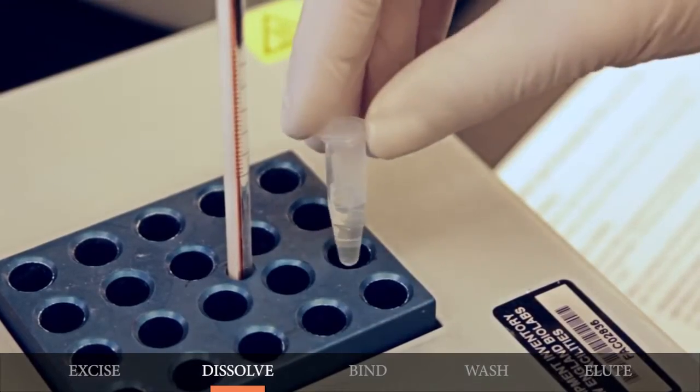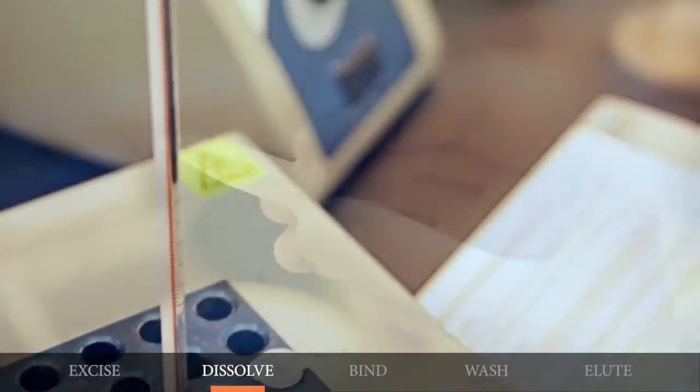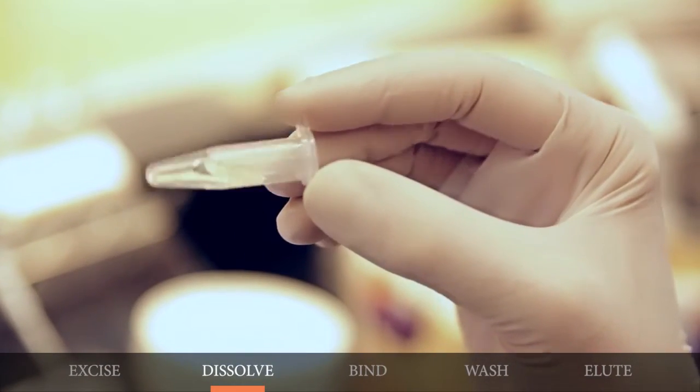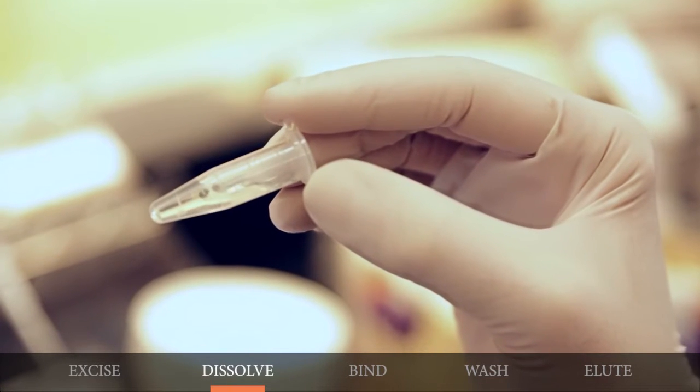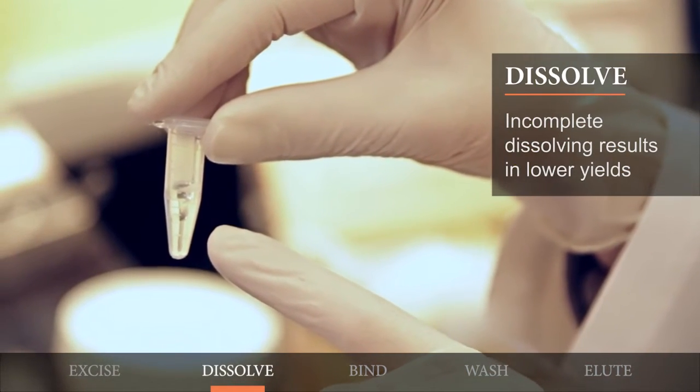Incubate the sample between 37 to 55 degrees for 5 to 10 minutes to melt the agarose, mixing periodically to ensure that the agarose completely dissolves. Incomplete dissolving will result in lower yields.